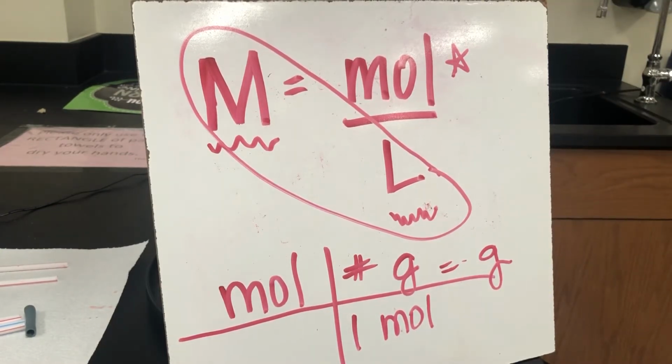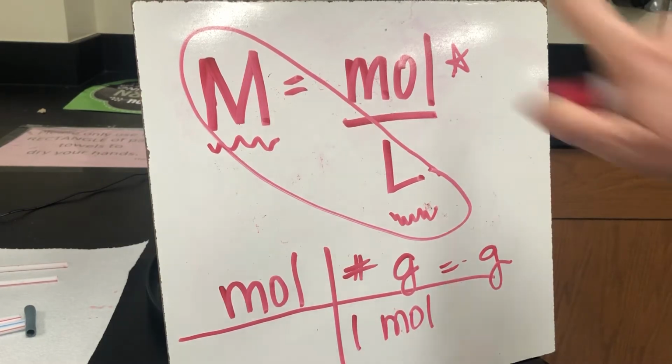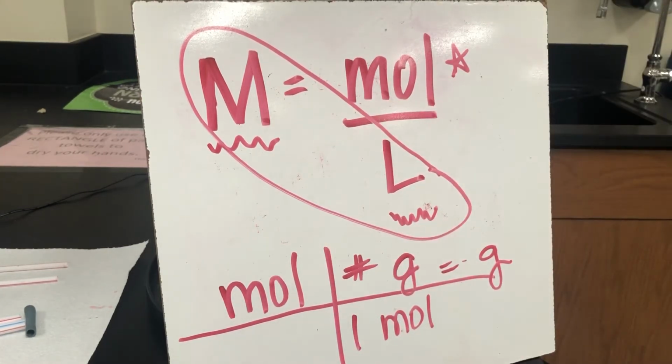There's some pre-lab questions up at the top. And they're basically just some math problems like we talked about in yesterday's video. So you're converting a lot of grams to moles, moles to grams, molarity, and you're going to be using this formula a whole lot. Then we're going to skip down to step 4, where it says your Kool-Aid calculations, show your work.